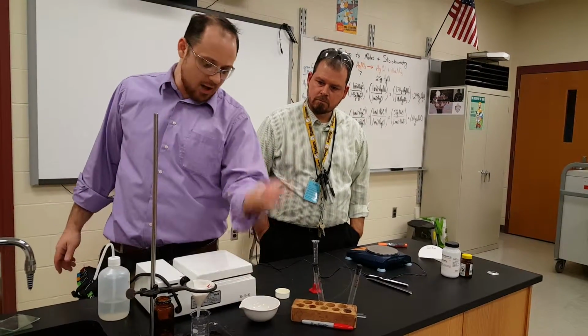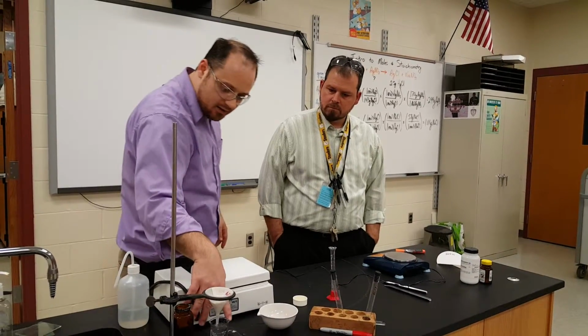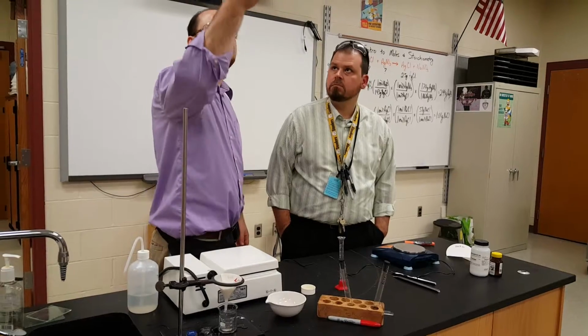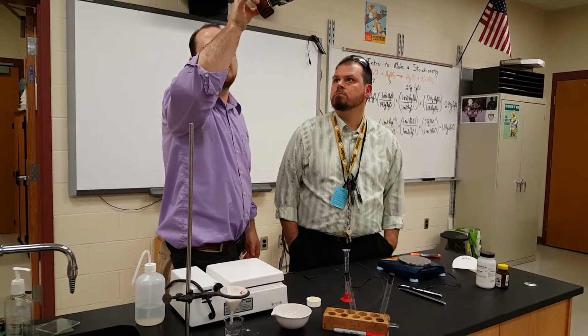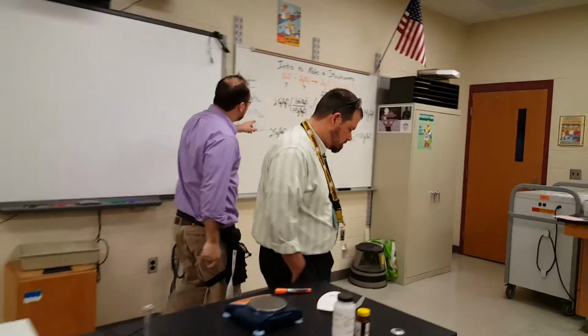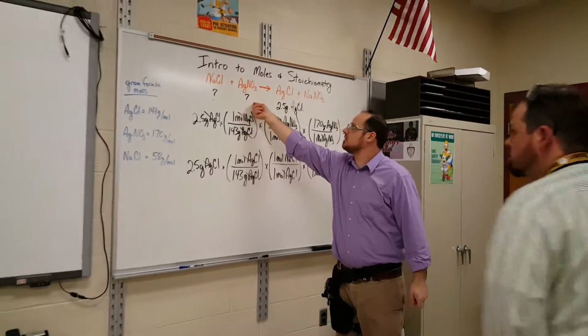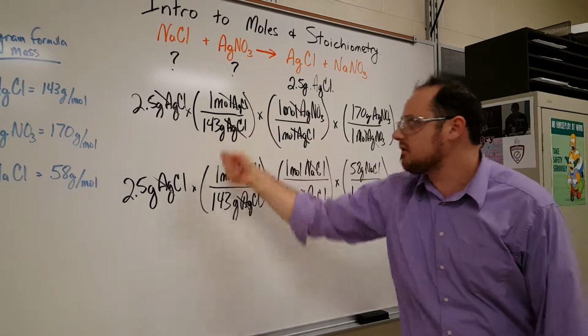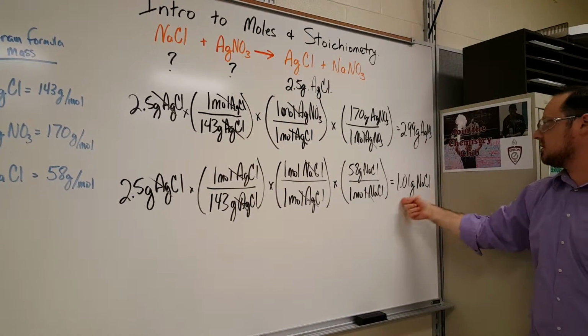We'll see if my sloppy analytical technique, I mean, there's probably a few milligrams there, I have a feeling we probably made most of what we were supposed to. But the whole moral of this story is that we took a chemical equation and a target amount and decided, okay, I can work backwards to find out how much mass of ingredients I needed to start.